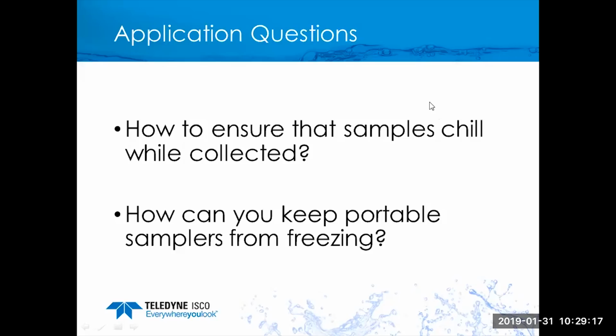There is a question that comes in that says, is the sample temperature rule still 4 degrees C plus or minus 1 degree, or has that recently changed? I am unaware of any changing of that 4 degree mark, but again, that doesn't naturally fit in every single application situation.